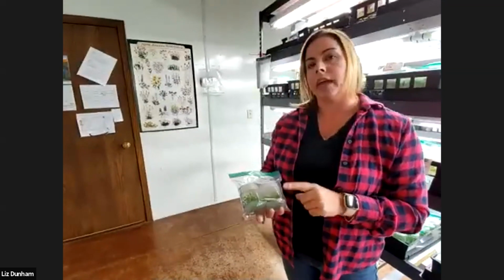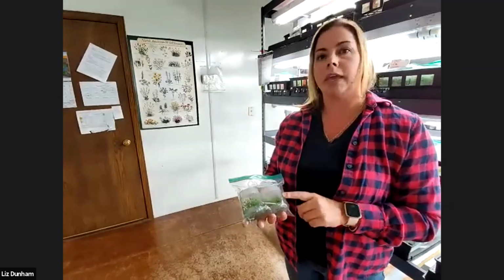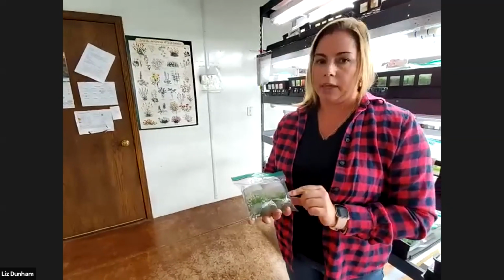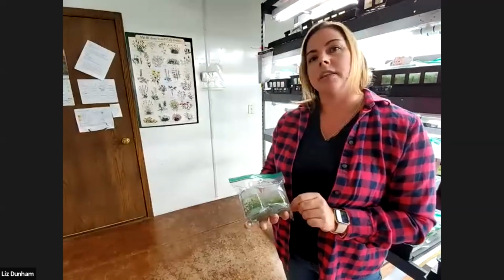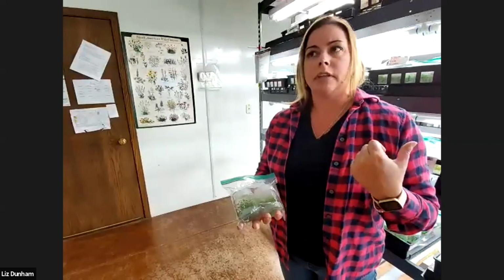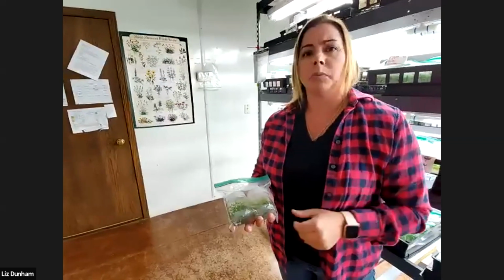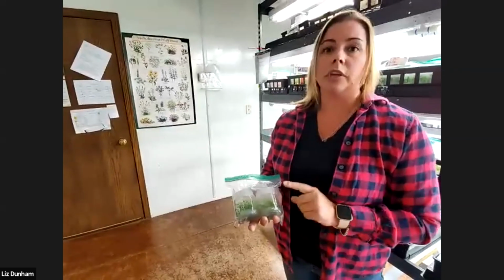These go directly out of culture. We'll take them out of the culture, rinse them off, put them in a baggie, and we have a contract with a grower, Mike DeGranchamp, in Michigan, and they go in a cooler and we ship them over the lake, and they go brown for like 20 bucks, so we can fit 10,000 in a cooler and they get here the next day. So these are really good for us.